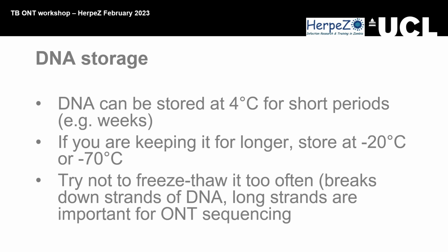What we put in the protocol is our kind of modified version of CTAB. You might not all do all of the things that we put in here, but our clinical trials team, we do quite a lot of sequencing, and our clinical trials team have modified it, so adding the yeast tRNA to help precipitate out all the final bits of DNA. This version of our protocol is kind of what we so far have as an optimal version for sequencing. So you might use something different, but that maybe because you're not using it for sequencing.